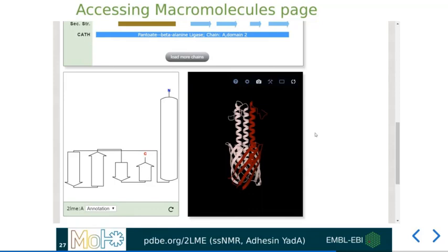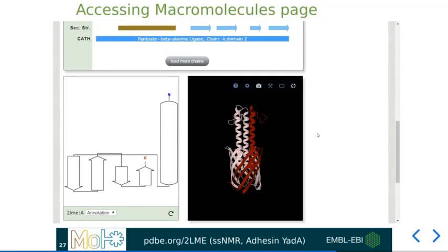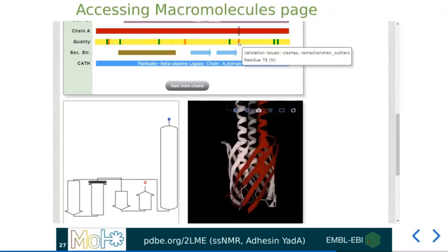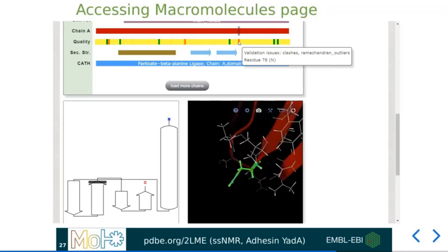Now these three panes are actually all tied together behind the scenes, and if you hover over any one feature on any of the three components, you should start to see how you can visually correlate data between the representations to further investigate the system. For example, here, I can again investigate which residues have the worst validation metrics. And if I choose to investigate one in particular by left-clicking, I'll get a zoomed view in the 3D interface MolStar window.